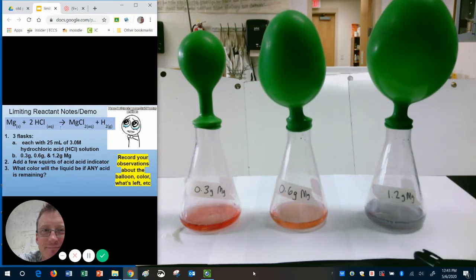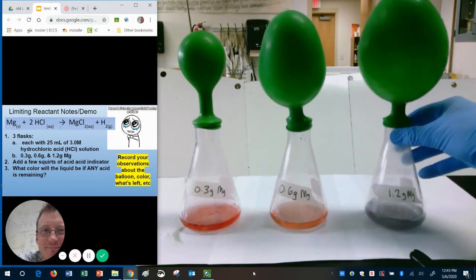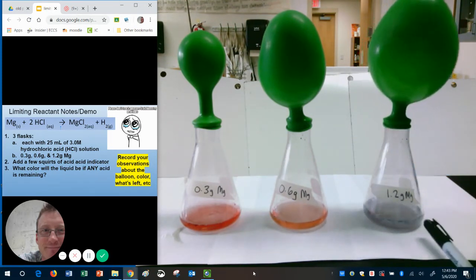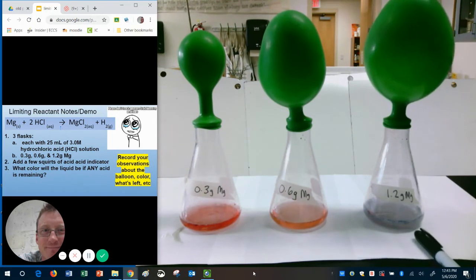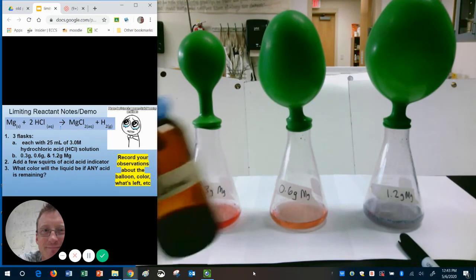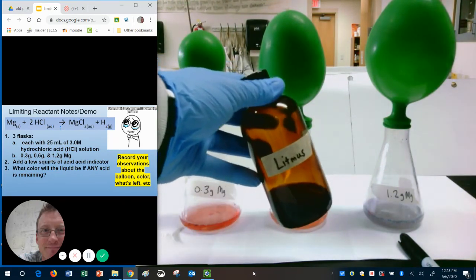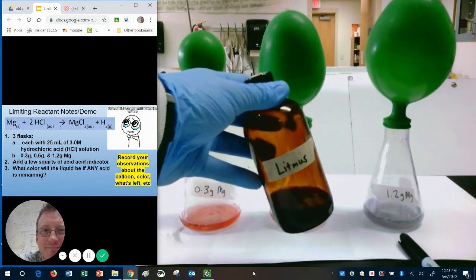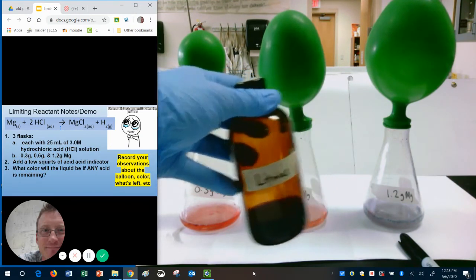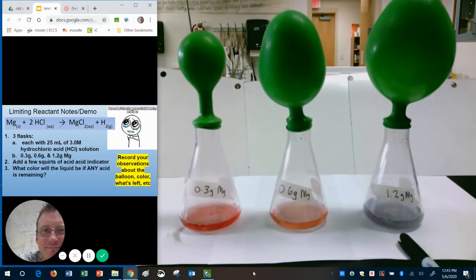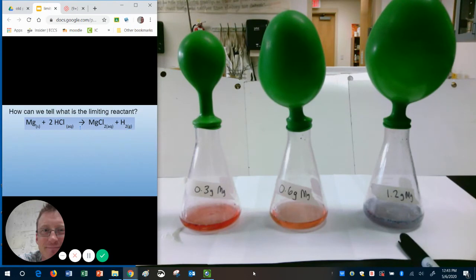Well, this last one here has kind of a purplish hue to it. It's totally changed color. Well, what does that mean? That means all of the acid has been used up. That litmus, when we added the litmus, when it has no acid to come in contact with, it has that purplish color.